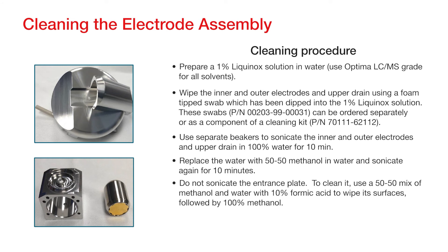Do not sonicate the entrance plate. To clean it, use a 50-50 mix of methanol and water with 10% formic acid to wipe its surfaces, followed by 100% methanol. The electrodes and entrance plate can be allowed to air dry on a lint-free cloth or dried with a stream of nitrogen gas of at least 99.5% purity.